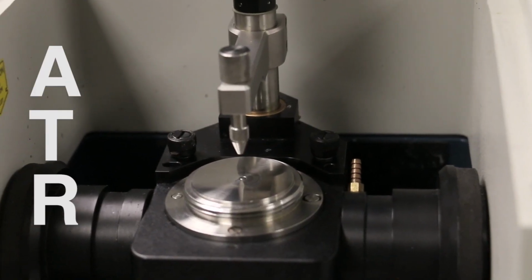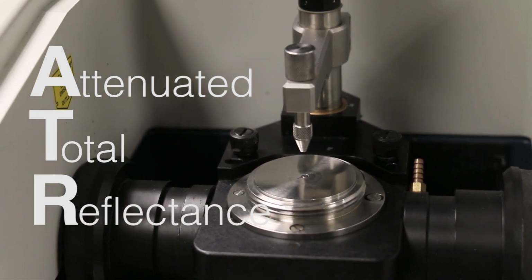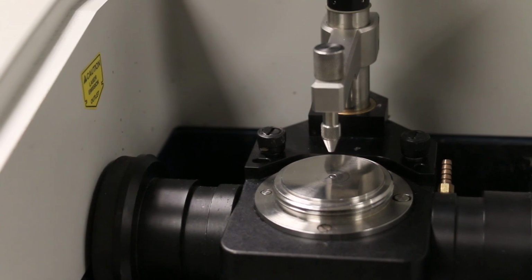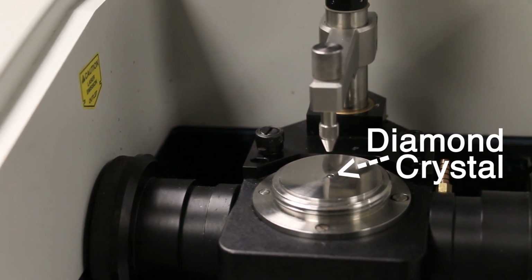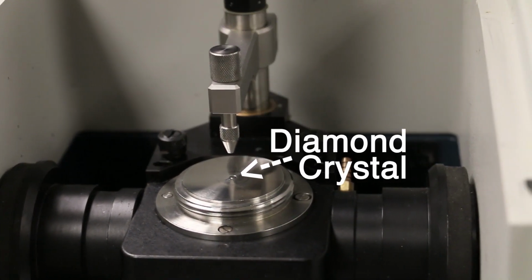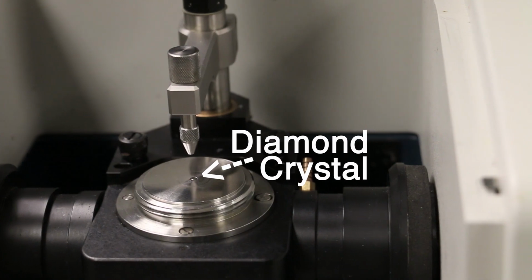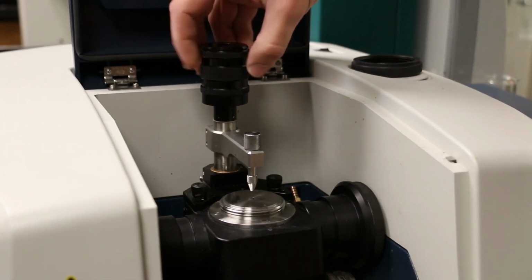ATR stands for Attenuated Total Reflectance, and this device uses mirrors to reflect IR radiation through a small diamond crystal into your sample and back into the spectrometer. The sample for analysis is placed on the diamond at the center of the ATR plate. The ATR cell has a pressure clamp which screws down to press the sample against the diamond crystal.